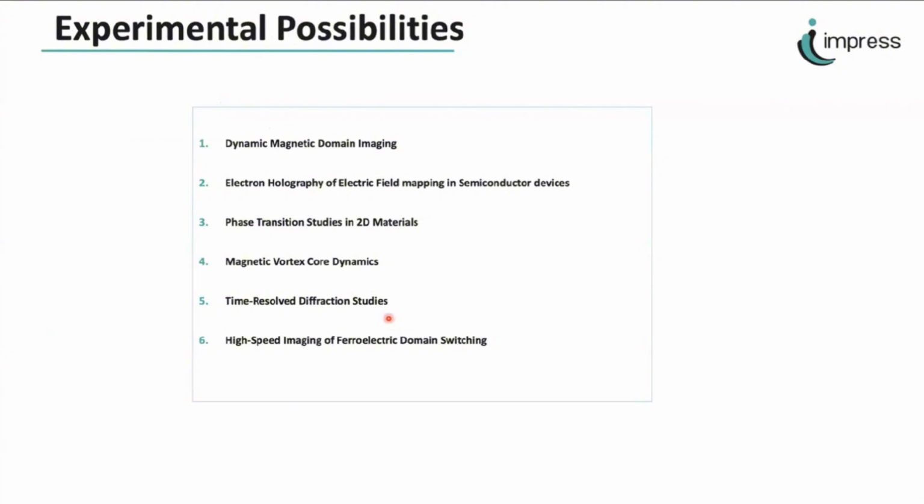The fields that we can study are quite wide and diverse. We can study magnetic transformation in different materials. We can study electric field mapping in different semiconductor devices, junction potentials, and so on. We can study phase transitions in different material systems, especially in 2D materials.